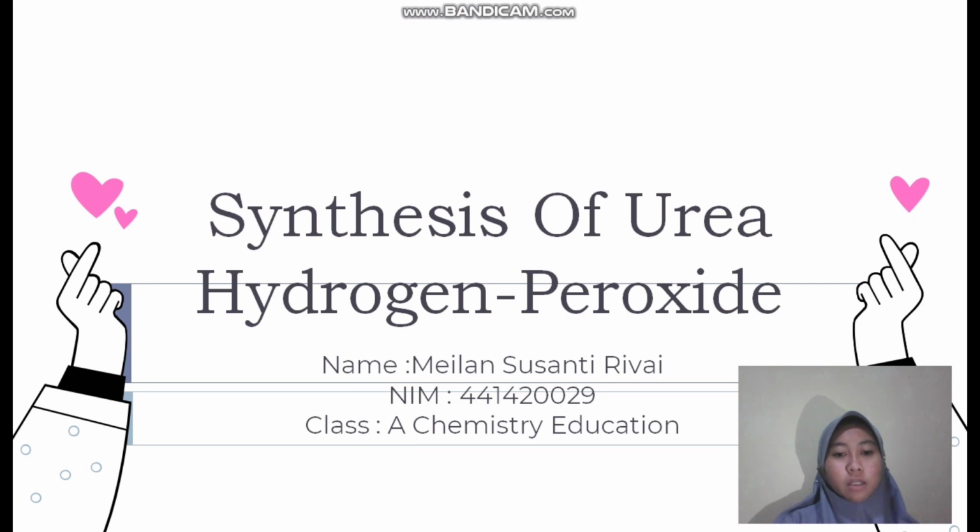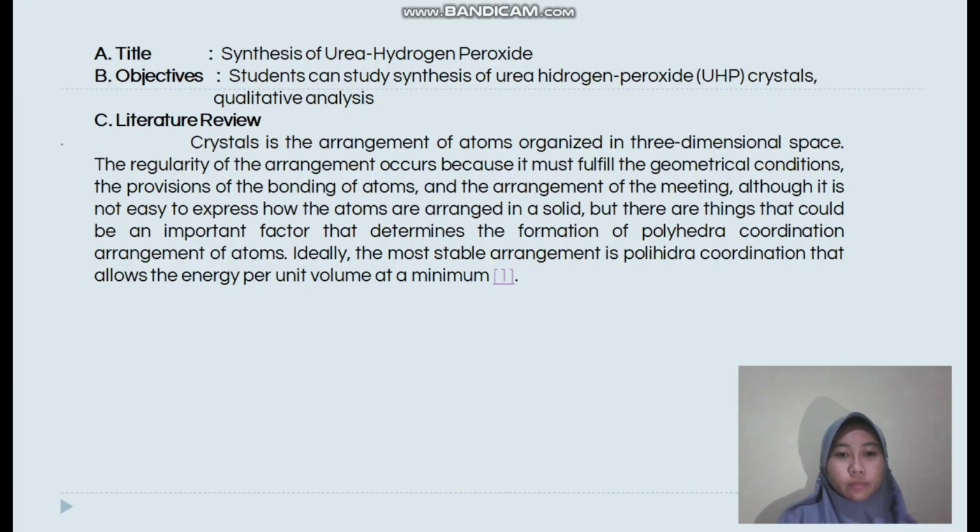I'm from class A Chemistry Education. I will present my practical result: the synthesis of urea hydrogen peroxide. Objective: students can study the synthesis of urea hydrogen peroxide, crystals, and qualitative analysis.